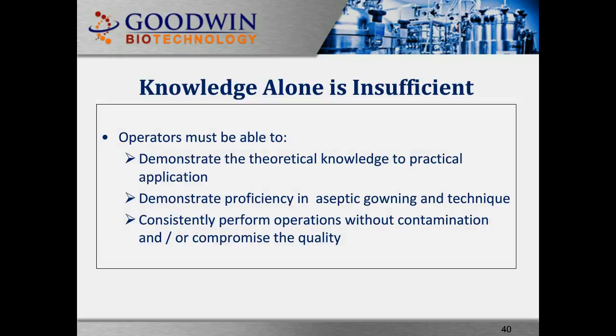Knowledge alone is insufficient. Operators must be able to demonstrate the theoretical knowledge through practical application. Operators must be able to demonstrate proficiency in aseptic gowning and technique, and consistently perform operations without contamination and or compromise of the quality.